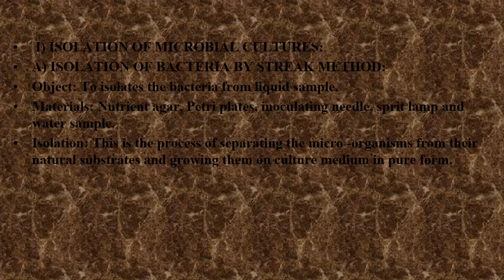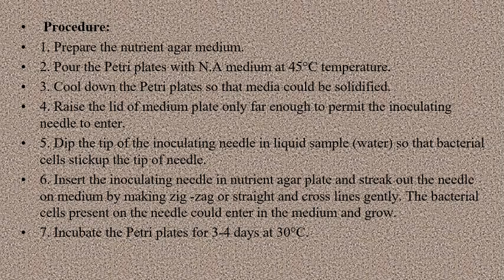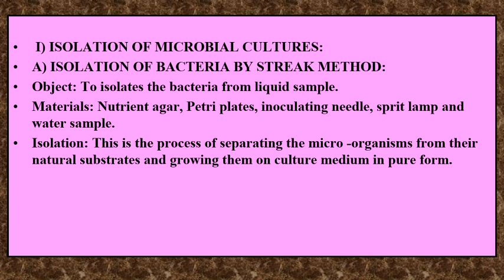So how to isolate and purify? Method of isolation of microbial cultures. The objective of this exercise is to isolate the bacterium from a liquid sample. Materials required: nutrient agar, petri plates, inoculating needle, spirit lamp and water sample.